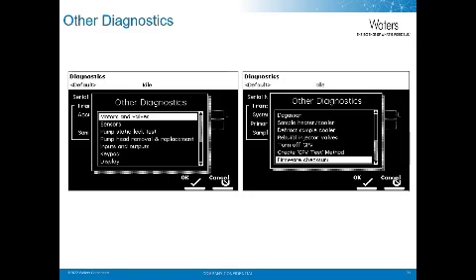I/O. This is the current status of the I/O terminals in the back of the 2695. Keypad. This tests the keys on the pad. Carousel. This tests the carousel drive. Sample heater cooler. This tests the sample heater and cooler.